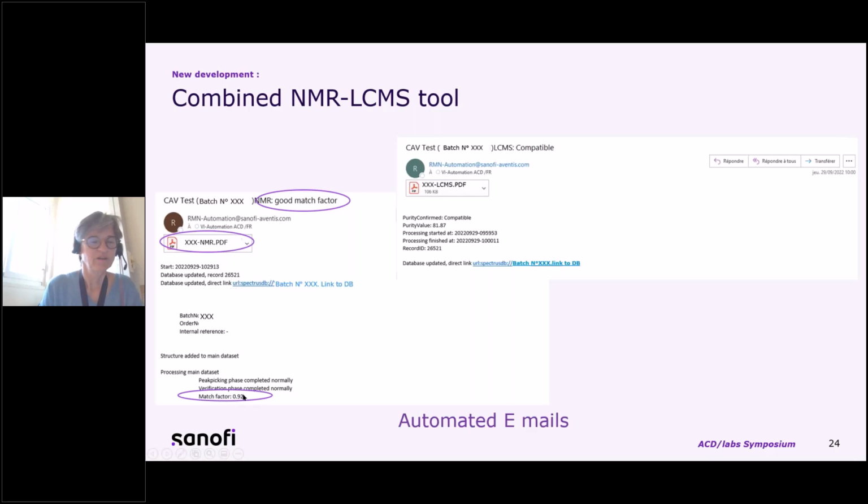And on the right, the same for LCMS results: the compatibility, a link towards the PDF report, the conclusion of the sample and the purity.